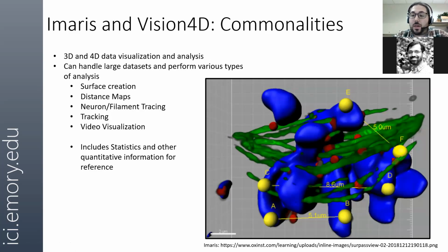They provide numerical values that can get you a volume of the relative structures and separation distances, all of those things that would normally be very tedious or impossible to do for a three-dimensional data set by hand. Using this software, you can quantify it a lot more comprehensively in order to analyze your data effectively.